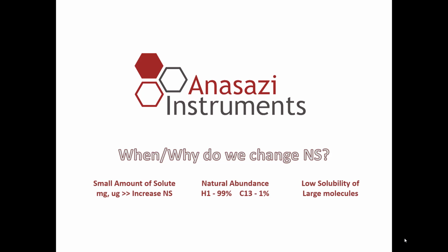Similarly, if we're looking at proton, which is 99% abundant, versus carbon, which is only 1% abundant, we're obviously going to have to do many more scans for the same amount of solute running a C13 experiment than we will have for the proton experiment.